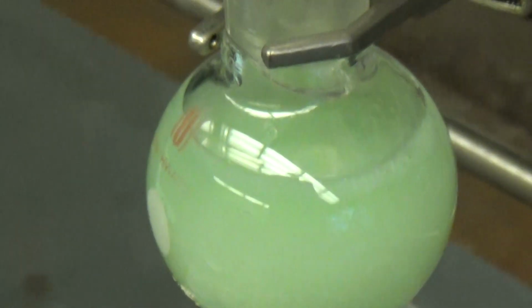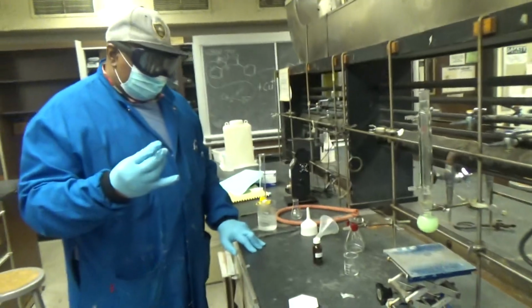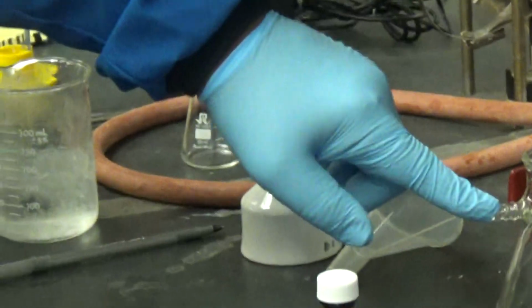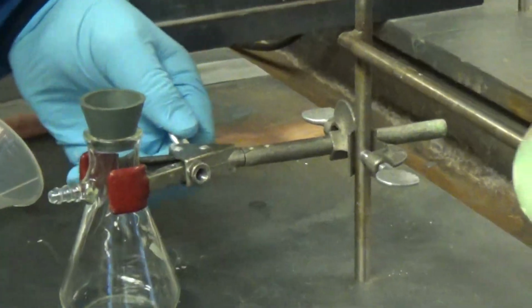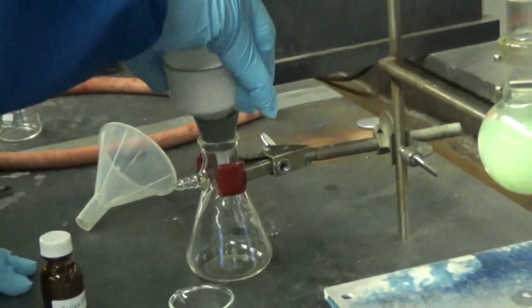Now we prepare for the next step, and get ready for a vacuum filtration. So we're getting ready for the vacuum filtration. We have the flask ready, the suction flask. The neoprene adapter. Put that here.